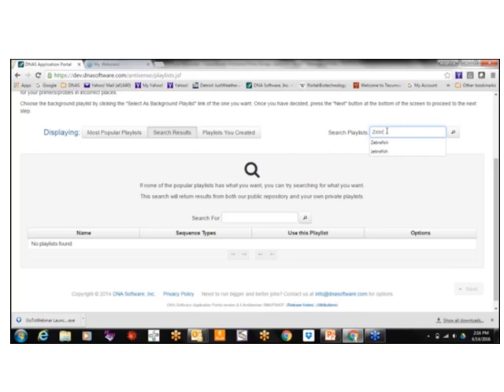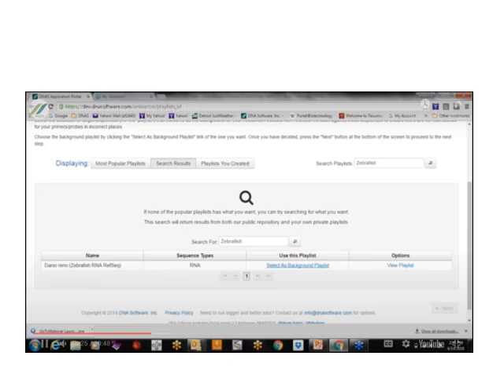After that, we choose the model that we are using. In this case, they are showing the zebrafish, the fish, not a human. After we choose the RNA source, which is the zebrafish RNA, this page will show up.